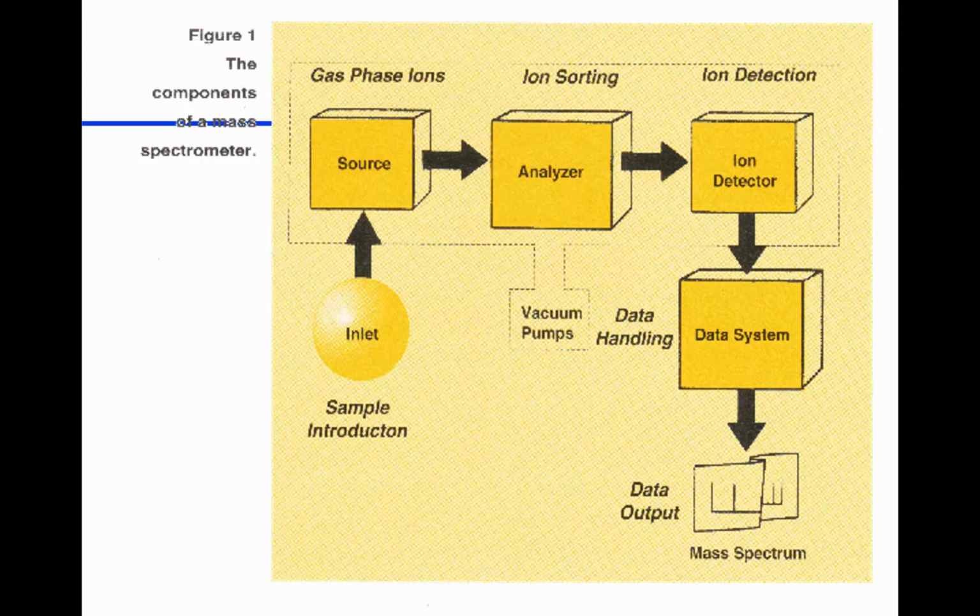The source is what we call the source of the ions. We're going to have compounds typically not ionized. We basically want to ionize them, and we're going to do this in different ways. One of the most common is we hit them with high energy. So we bombard our compounds with an electron beam. That electron beam is high energy, 70 electron volts. And that molecule just explodes in all kinds of pieces: neutral, positive, negatively charged ions.